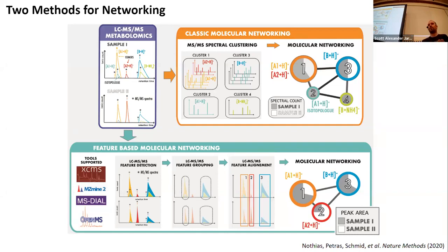Because there you don't have to worry about any peak picking, and you basically just dump your mzML files into GNPS, and it creates a simplified molecular network only on MS2 level. But again, you first of all want to get the analysis done, right? And if you struggle with the settings and can't manage to go all the way through, then go back to classic molecular networking.